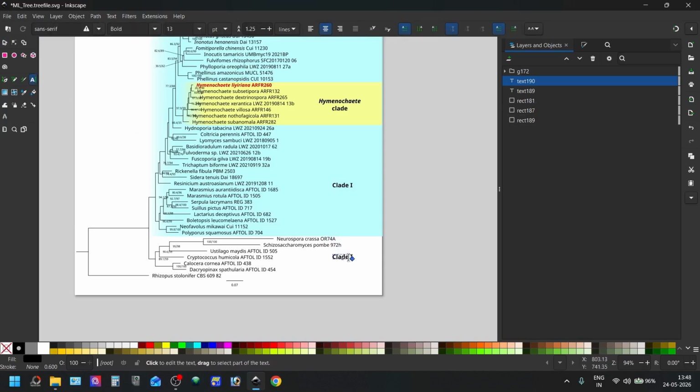Just clade 2. This is the copy of your box, I think.